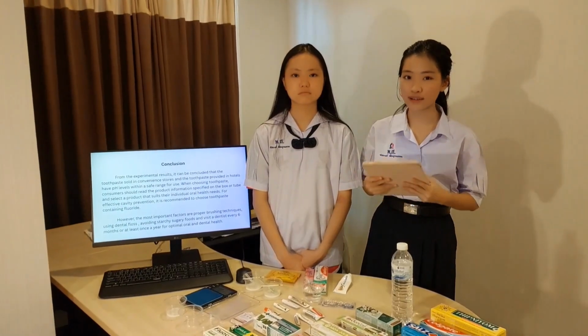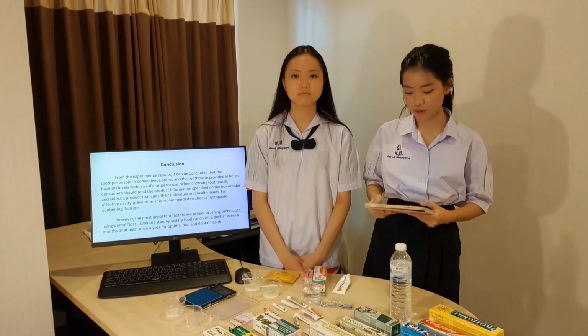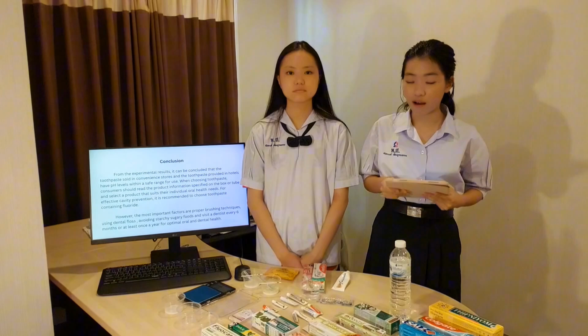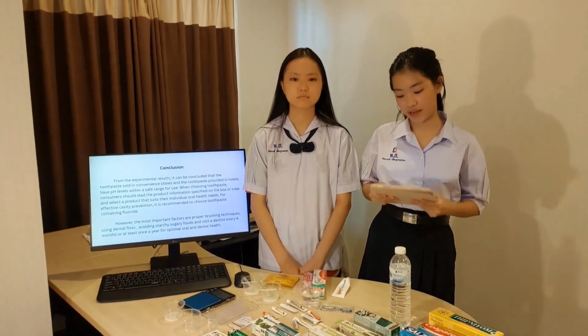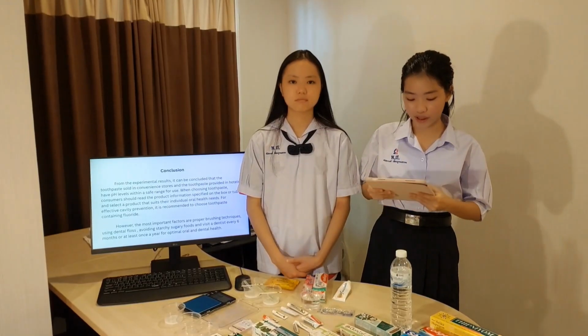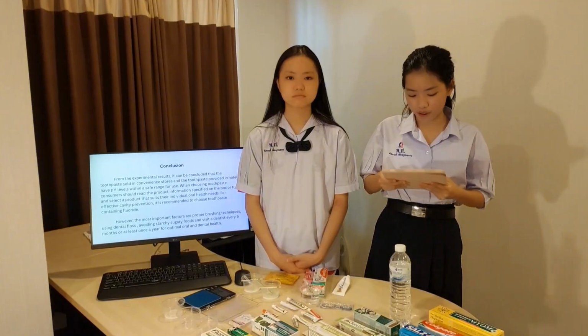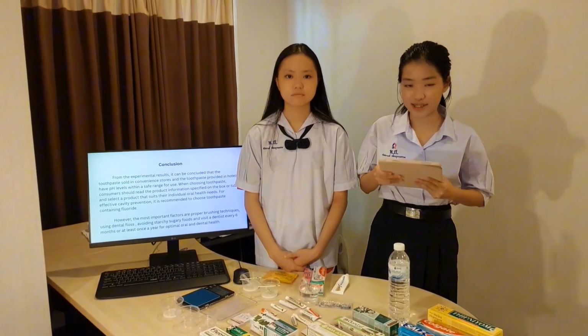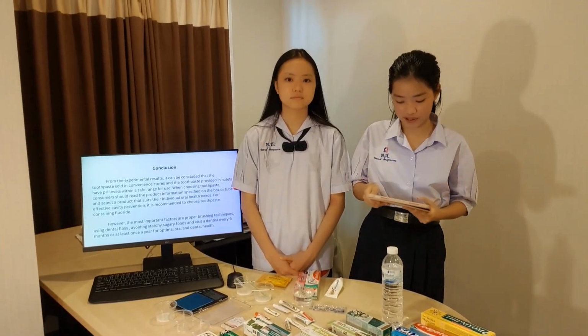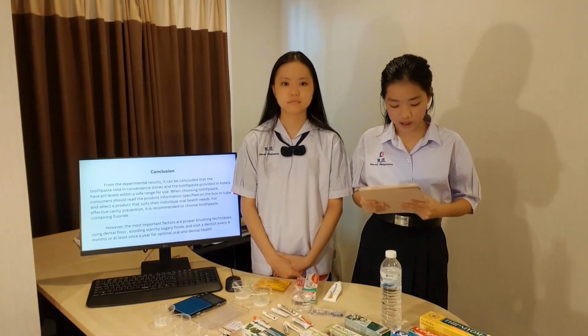Now, it's our conclusion. From the experimental results, it can be concluded that the toothpaste sold in convenience stores and the toothpaste provided in hotels in Thailand have a pH level within a safe range for use. However, the most important factors are proper brushing techniques, using dental floss, avoiding sugary foods, and visiting a dentist every 6 months or at least once a year for optimal oral and dental health.